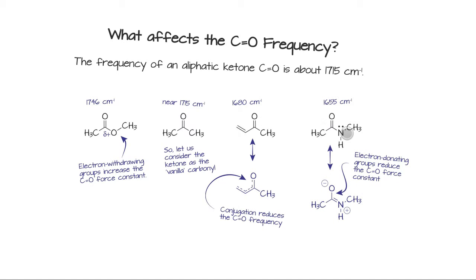And then amides are electron donating. They have a lone pair, and oxygen is significantly more electronegative than nitrogen. So I can imagine donating those electrons up toward oxygen by resonance, and this split charge structure is not as ridiculous as you might think, because of course oxygen loves electrons, and nitrogen's comfortable being positively charged. We see it's a base, it's positively charged in water when it accepts a proton. These are both situations we're comfortable writing, so that's a reasonable resonance contributor to write.